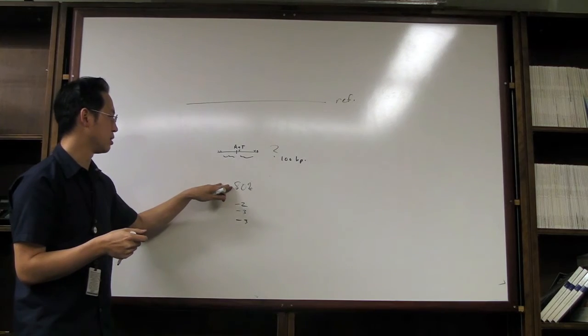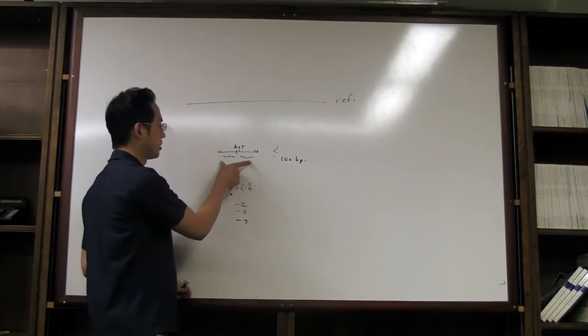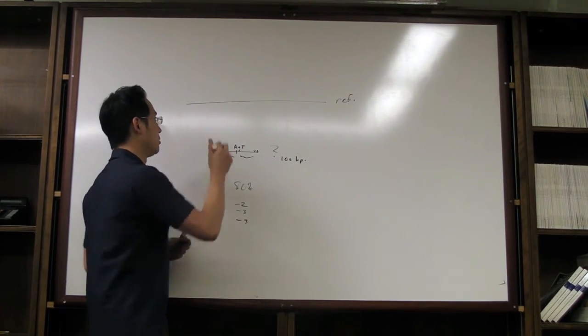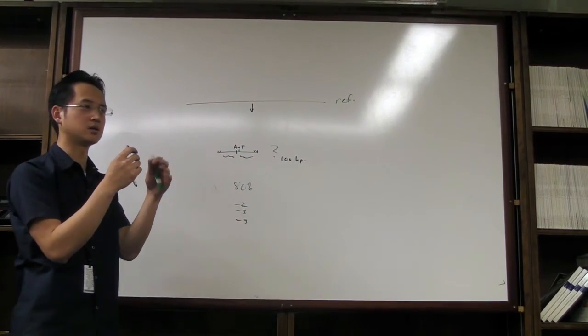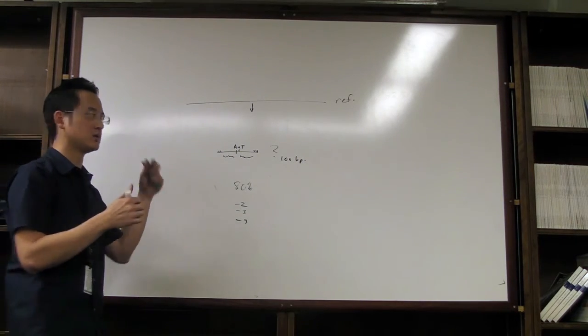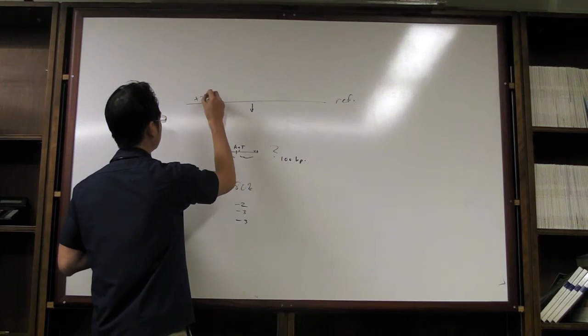And they do that for each read. To make it faster, typically they don't just take this and compare it base for base. They usually make some iteration of this to represent this in a different kind of way. So that's called sort of indexing. And that's what the Burrows-Wheeler Aligner does, is it makes this into, so instead of like, I'm making an analogy here, okay?